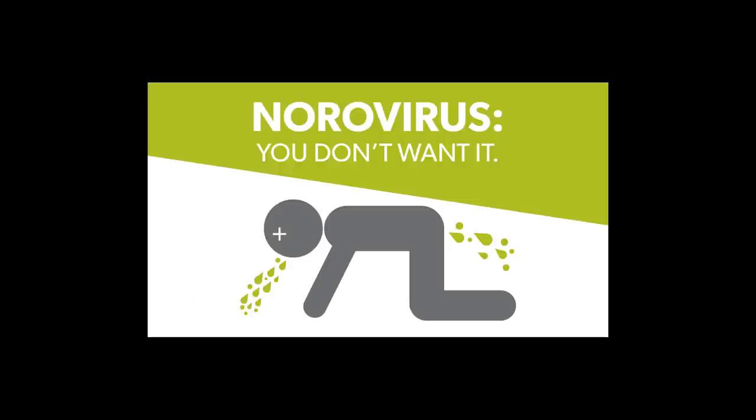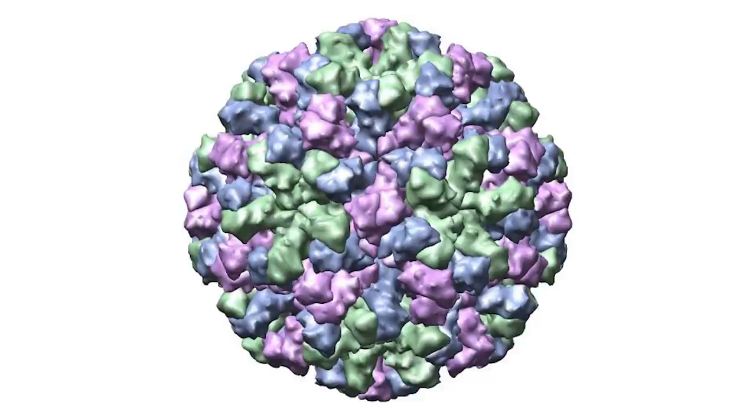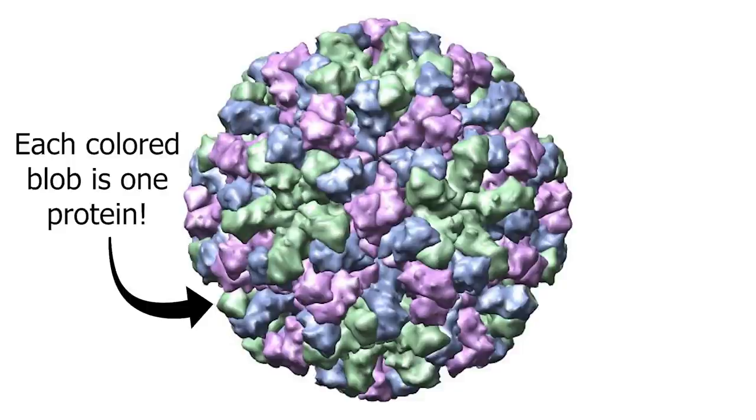So these experiments are all part of a project to make a norovirus vaccine. I'm actually trying all sorts of different vaccine candidates, and this is just one of them. This particular vaccine involves making the protein that allows norovirus to attach to our cells, which is similar in some ways to the COVID spike protein that we all probably know about at this point.